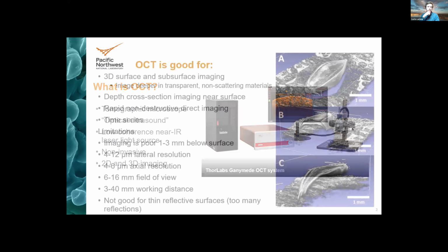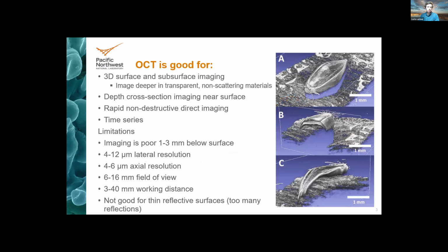Okay, so what's OCT good for? It's great for doing three-dimensional surface or even subsurface imaging. You can image deeper if your sample is transparent and it's less scattering.